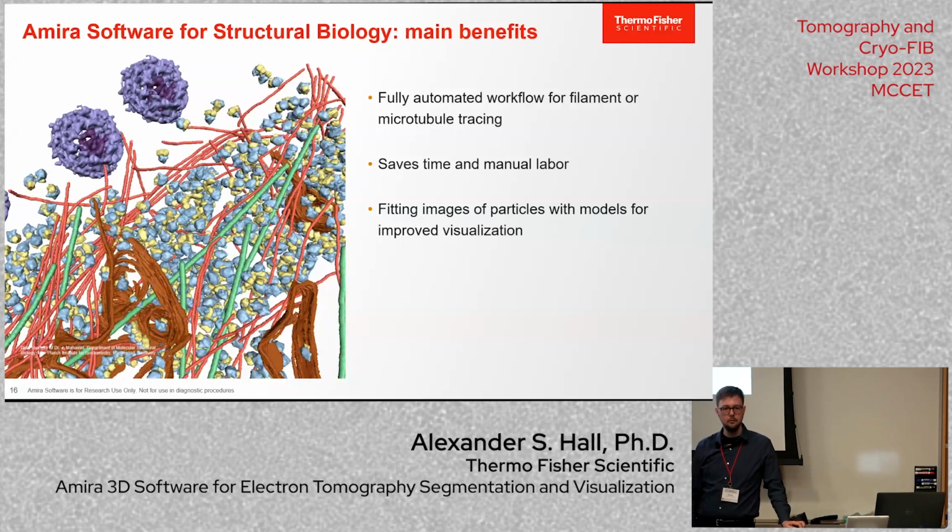Hi, I was just curious, when you're actually doing the ground truth and you're setting the stage for that, manually picking features, is there a strategy one uses in which features you are in fact highlighting in that ground truth? You start with the larger or smaller structures, the more difficult? You can certainly spin your tires segmenting the whole image, but that may not be that useful to you. So your project will probably focus on one or two features. So certainly focus on those.